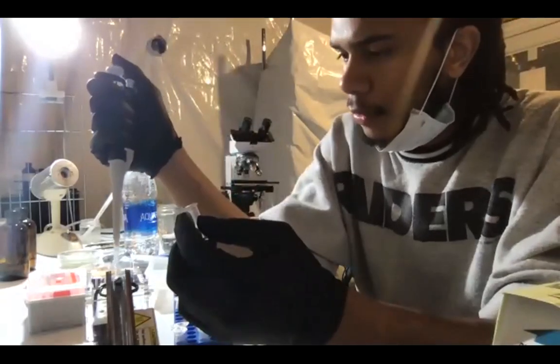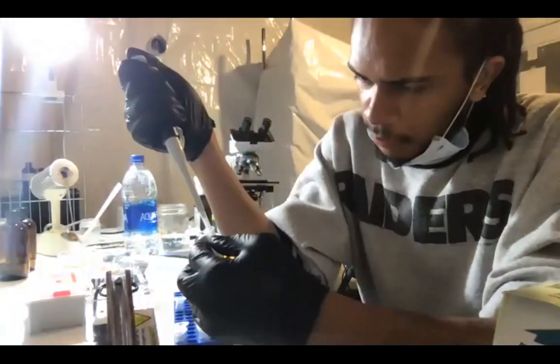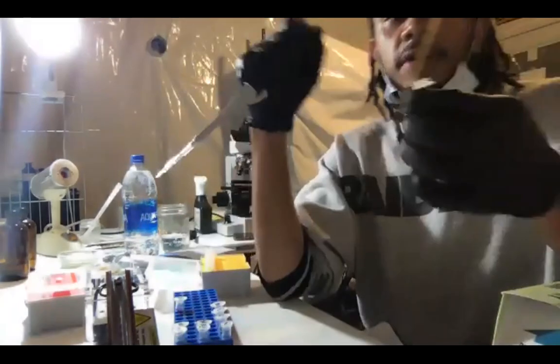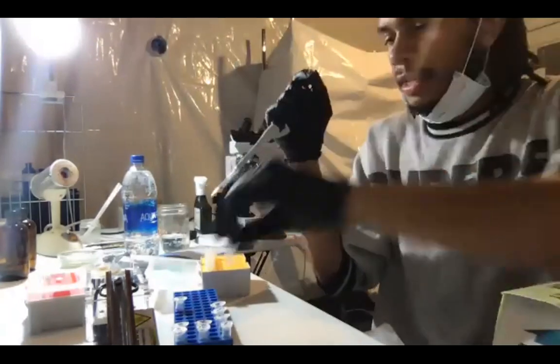Number 3 and number 4. And I ended up with some left over, and you're not going to want to use that again because it already started reacting.